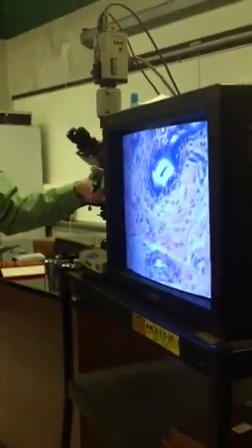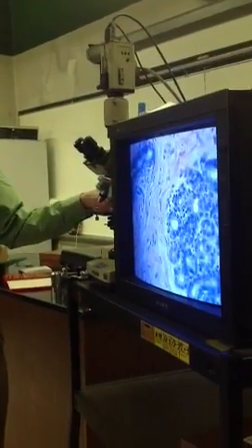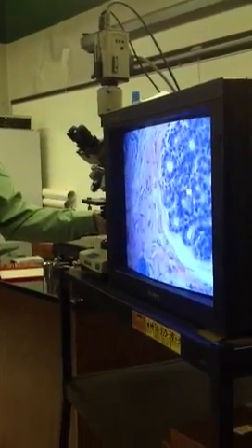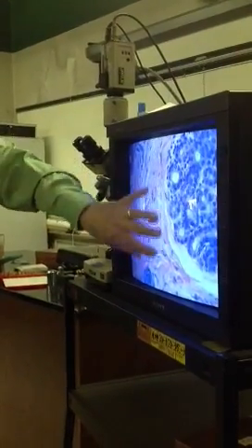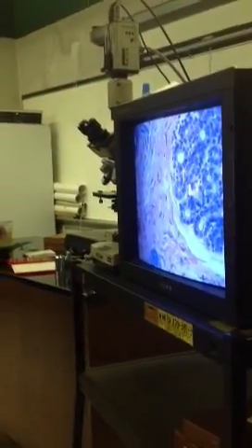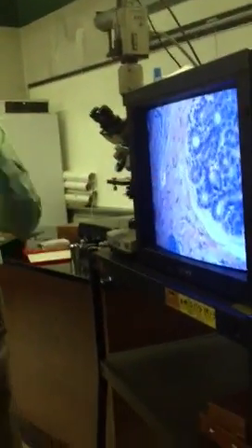Okay. And notice that you don't want to mistake this with squamous stratified epithelium. These are all very cuboidal cells. And so anyway, this is a section through a lobule. And you don't see any big cells with nuclei anywhere in the stroma where they don't belong. So this would be a typical section through a lobule with some stromal tissue showing.